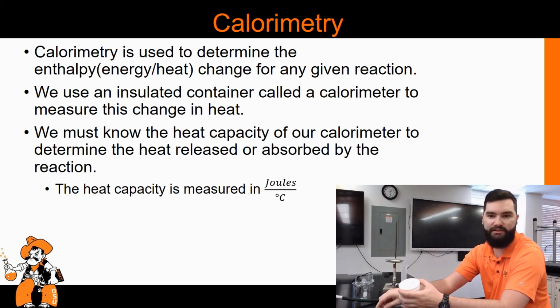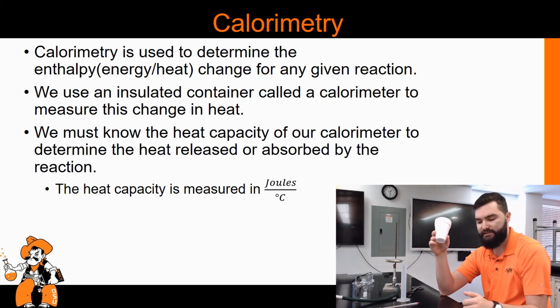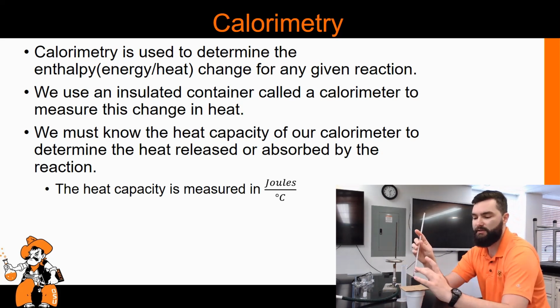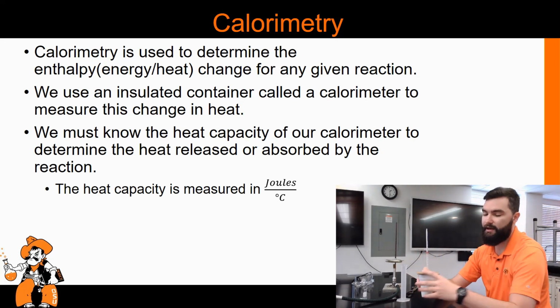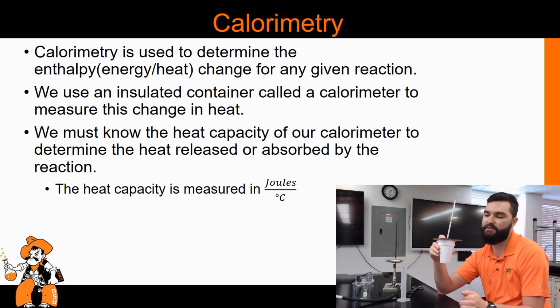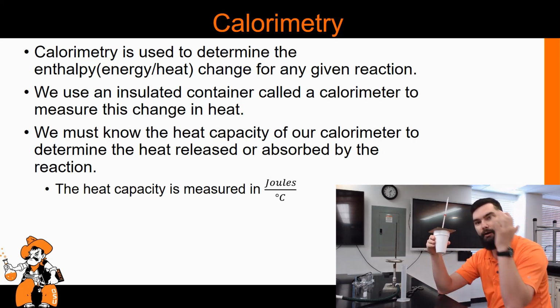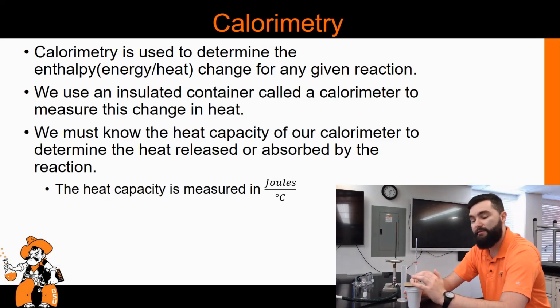So for our purposes today, we can make a calorimeter via 2 coffee cups. Okay, we stack our coffee cups like so and put a piece of cardboard over the top, put our thermometer inside, and now we have a calorimeter that is mostly sealed to the outside elements. Okay, this is going to allow minimal heat to escape from the contents or go into the contents from the outside air.